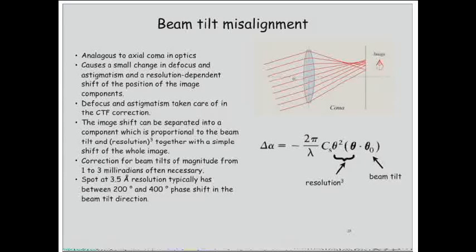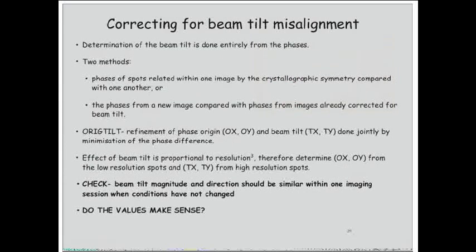And this just shows how that phase shift is related to the resolution, so the diffraction angle, and the beam tilt. So again, I would refer you to some of the papers that I've described. And you can determine that beam tilt by looking at the phases, and there are 2 different ways.